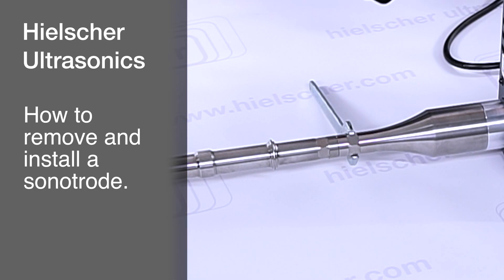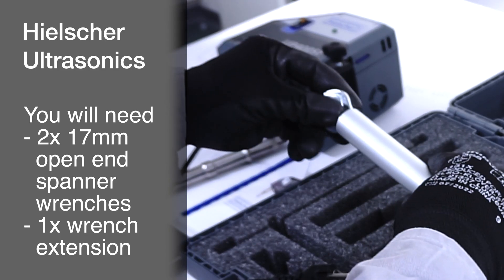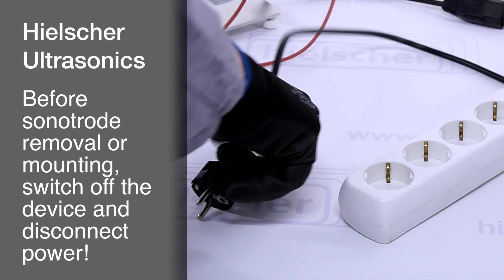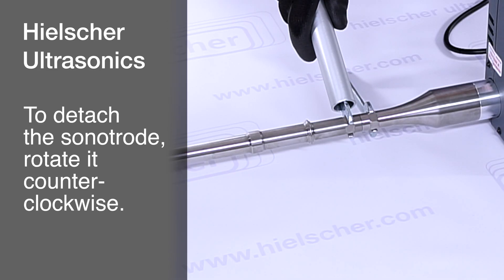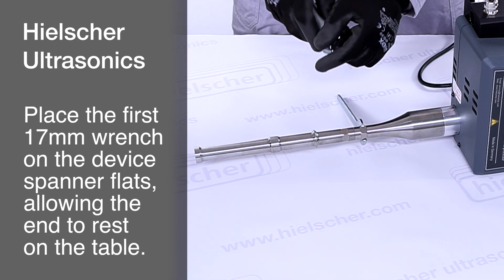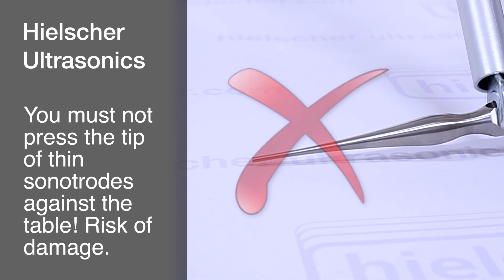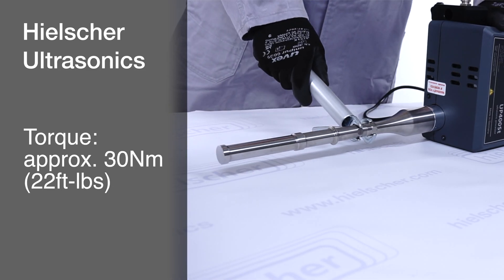Next, we will show you how to remove and install a sonitrode. For sonitrode replacement, you will need two 17-millimeter open-end spanner wrenches and a wrench extension. We recommend wearing non-slip gloves. Before removing or installing a sonitrode, switch off the device and disconnect it from the power source to ensure it cannot be accidentally activated. Place the device on a stable, even surface as shown. To detach the sonitrode, rotate it counterclockwise. Place the first 17-millimeter wrench on the hex spanner flats on the device, allowing the end of the wrench to rest on the table. Attach the second 17-millimeter wrench with the extension to the sonitrode's hex spanner flats, turning counterclockwise to loosen. For sonitrodes with thin tips, take care not to press the tip against the table, as this could cause bending or damage. The torque is approximately 30 newton-meter or 22 foot-pounds.